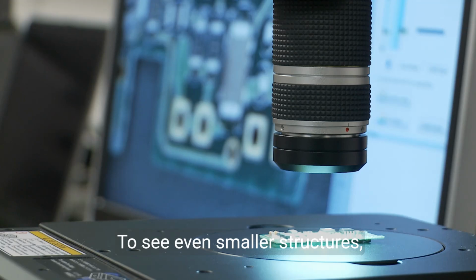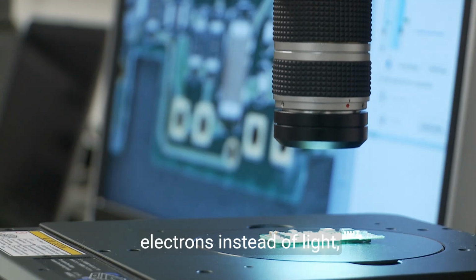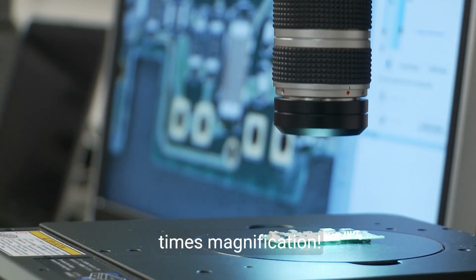To see even smaller structures, electron microscopes use beams of electrons instead of light, reaching up to about 1,000,000 times magnification.